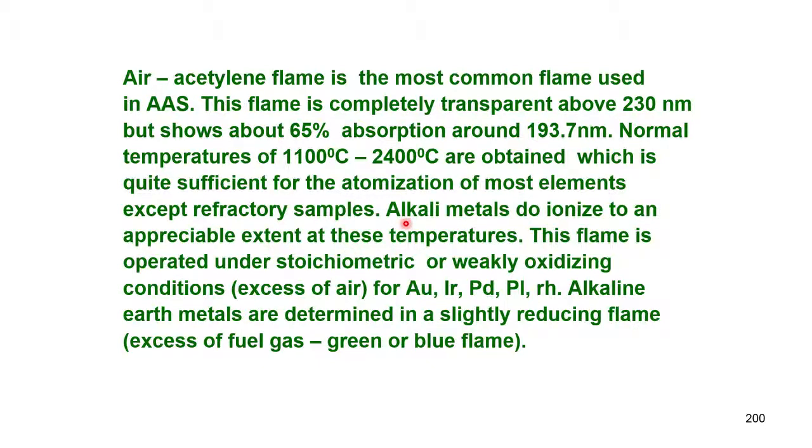It is a property of the refractory elements, and alkali metals, what happens? They not only form free atoms, but they also ionize to an appreciable extent at these temperatures. So, atomic absorption for alkali metals like sodium, potassium, lithium, cesium, rubidium, etc., is not easy.